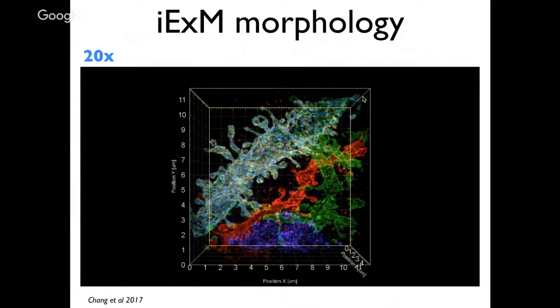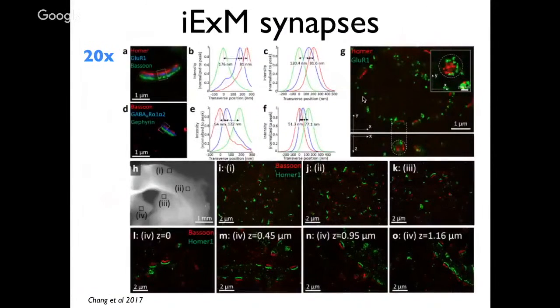And here what you can see in these images is that we're starting to become limited by the chemical tagging process, where we're starting to see the discreteness of the chemical tags down at the molecular level as a limiting factor in our resolution. But there's ongoing work to try to push beyond that.